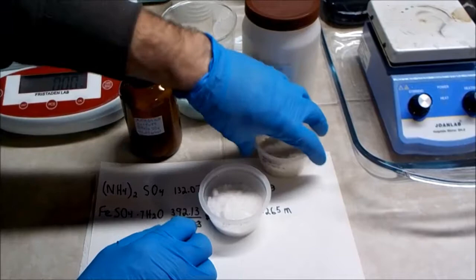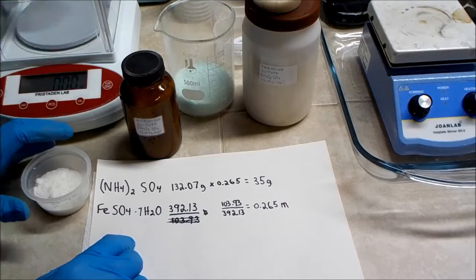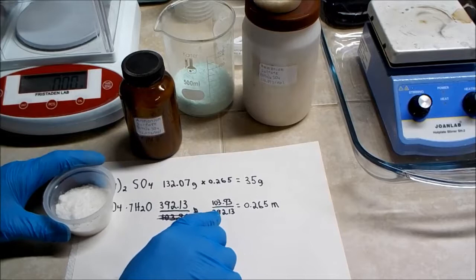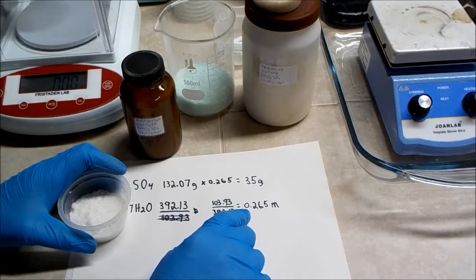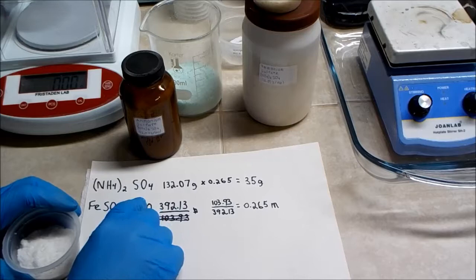All right, so as I just showed, I had 103.93 grams of the iron sulfate heptahydrate and one molecular weight of iron sulfate is 392.13. So you divide those two and you get that we have 0.265 moles here of iron sulfate. So I actually need 0.265 moles of ammonium sulfate to add with that.